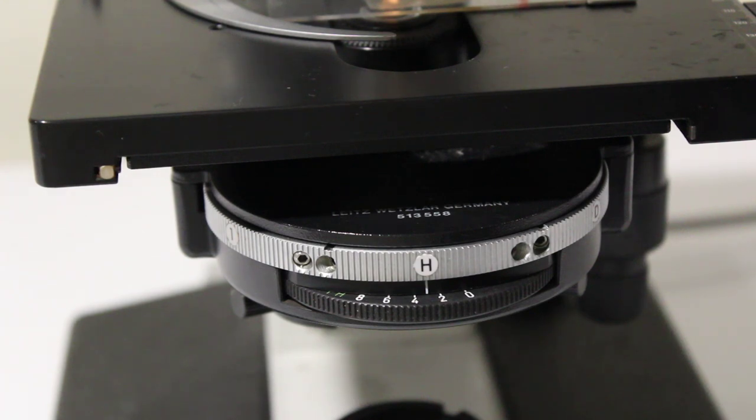Now the condenser on my microscope is a little bit more fancy than the standard Abbe condenser and it has a lot of features that aren't needed in the brewery, but if you happen to get a microscope with these features you might find them quite useful. I will spend most of video 5 showing you how the condenser works and how to align it properly but I quickly want to touch on the few extra features that my condenser has so you can see what they add.